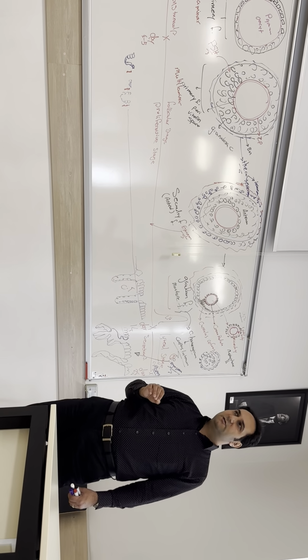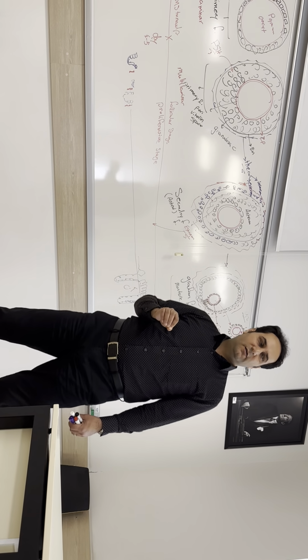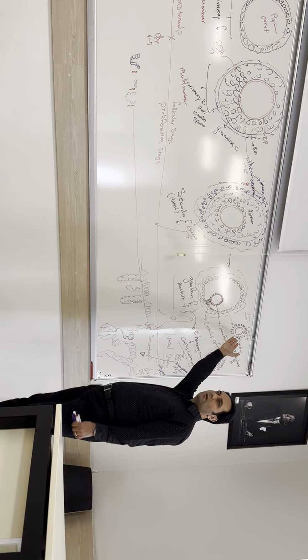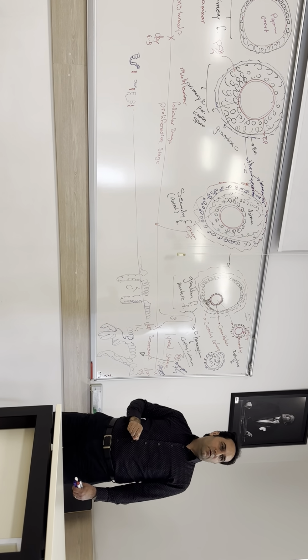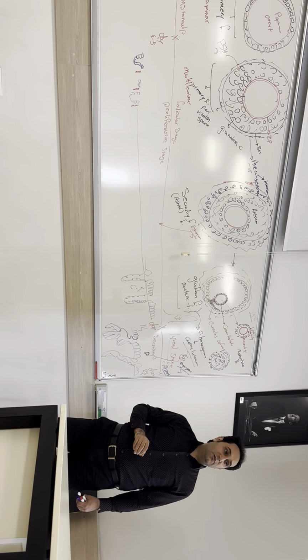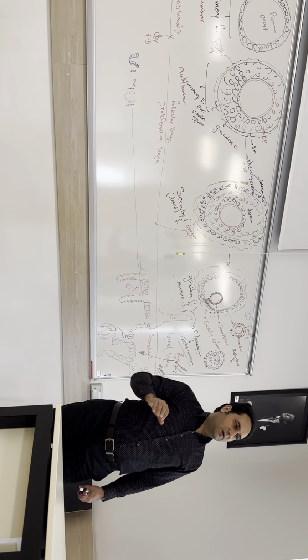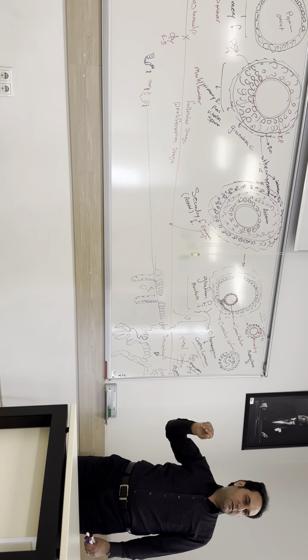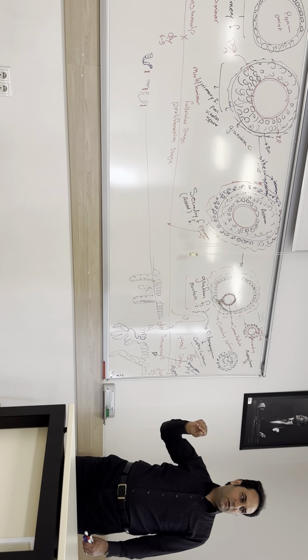These PEG cells have a role in secreting nutrition to the oocyte cumulus complex and also sperms which previously entered into the ampulla side. Okay?